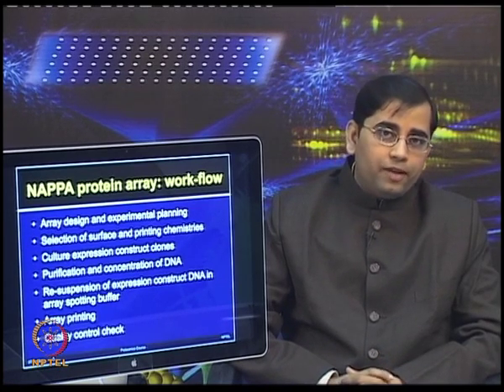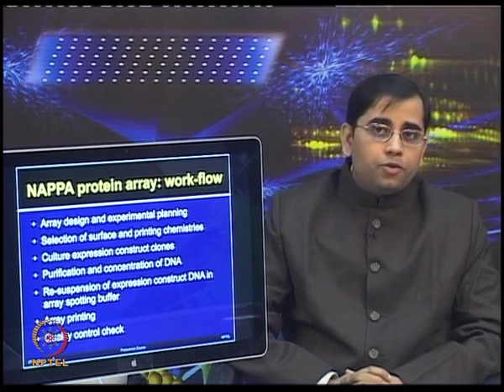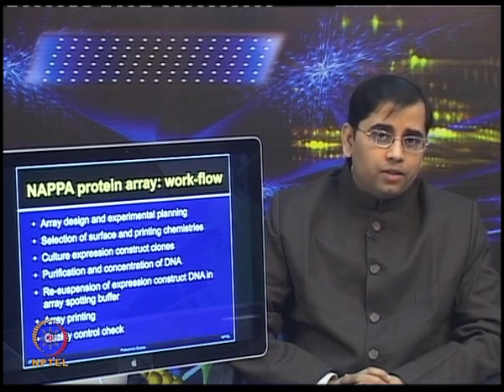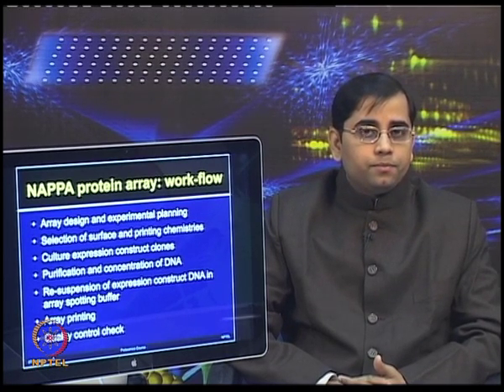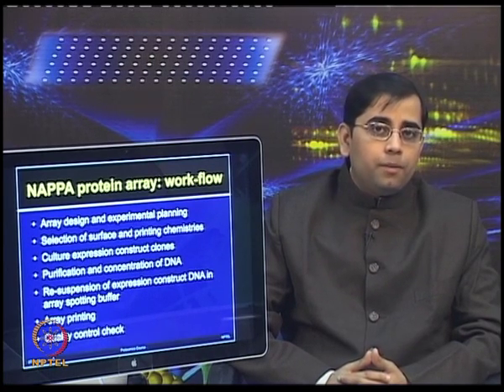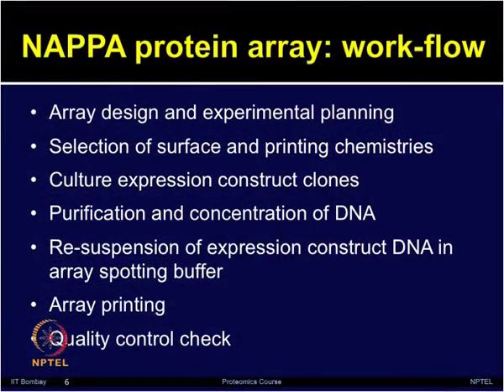Then, what type of surface one needs to select, what printing chemistry needs to be used. And since we are talking here about the cell free expression based system, you need the DNA to start with. So, how to express and construct those clones. Now, once you have done the culturing, then you need to purify and concentrate DNA. Almost all the molecular biology labs perform these experiments on a day-to-day routine, and it is very straightforward to do the DNA extraction, DNA concentration, etc.